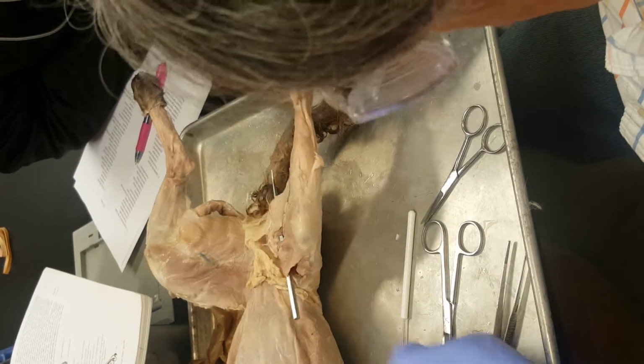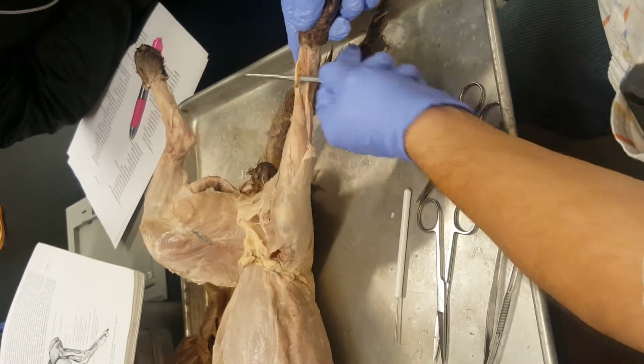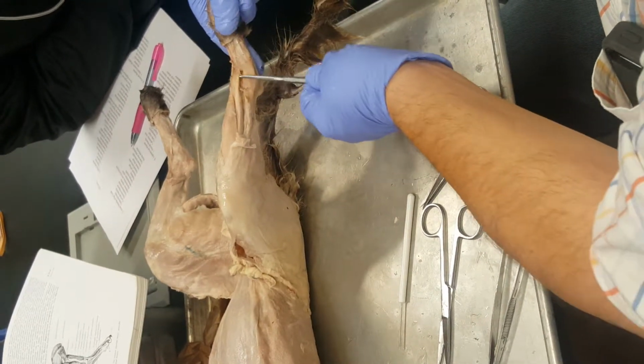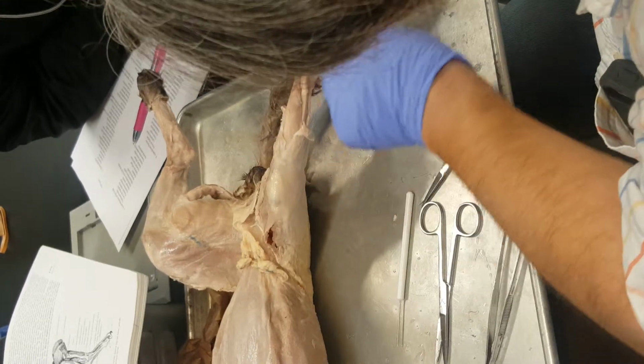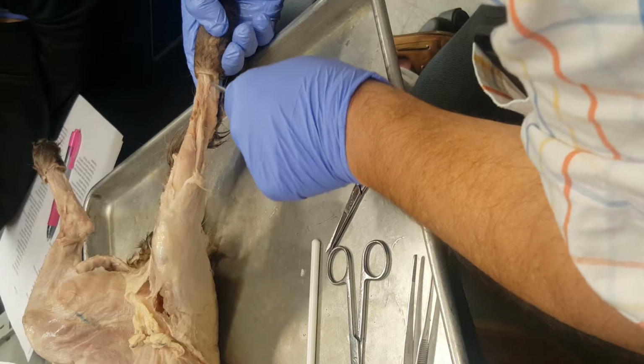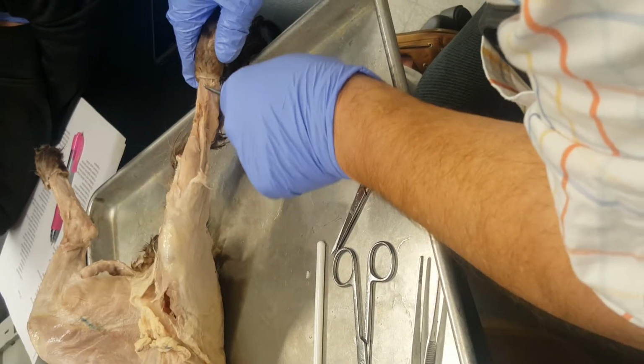Then this is your tibialis anterior. Here's your extensor digitorum longus down here, and if you peel these back, you can actually see the tendons. Probably get it to about there. You can actually see the tendons fanning out to the digits.